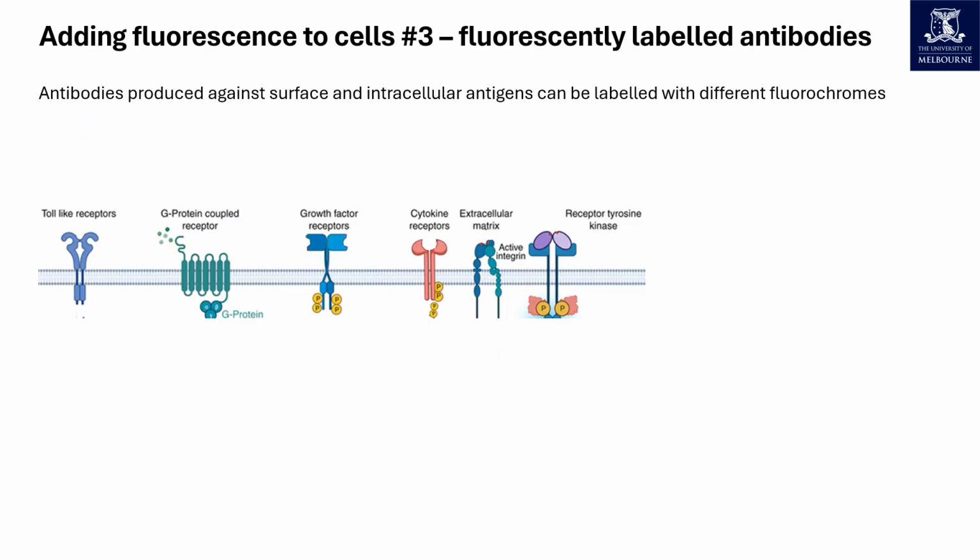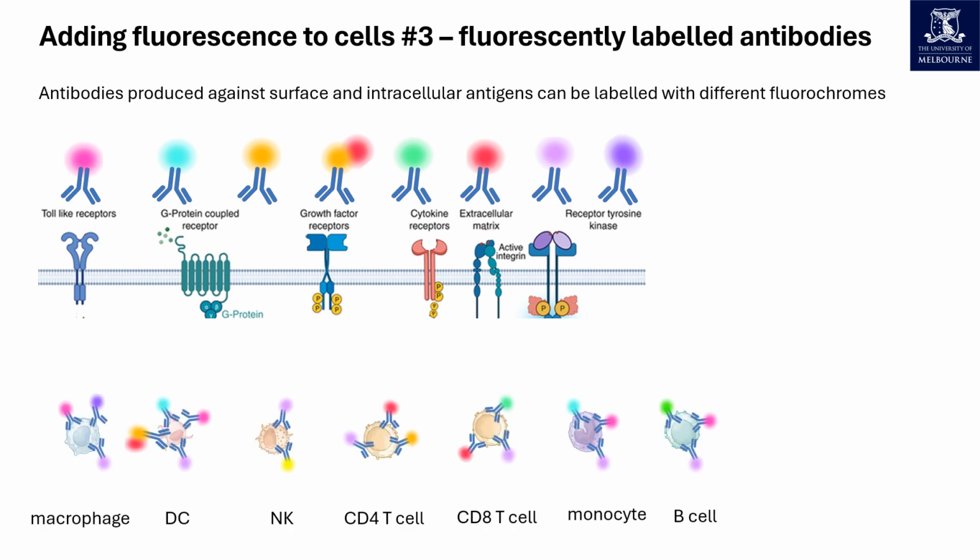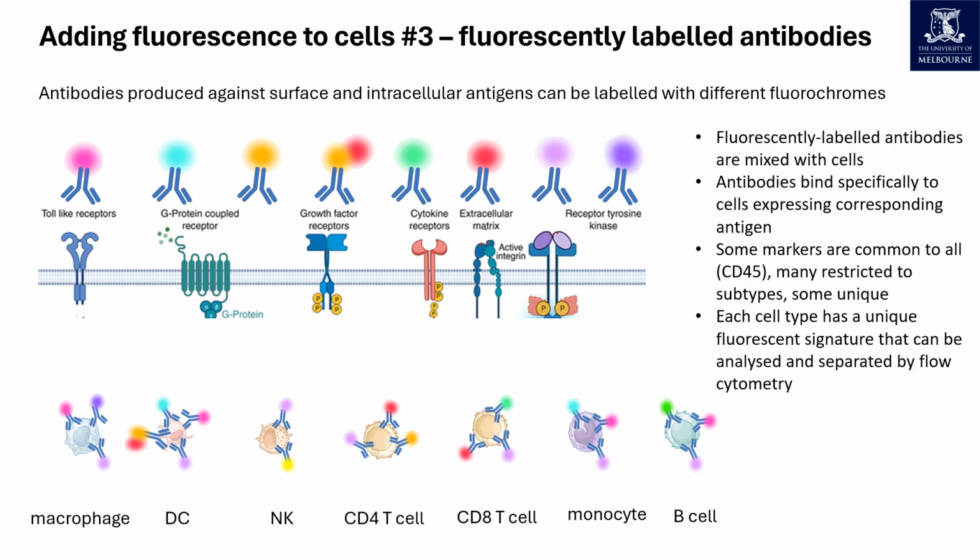In cytometry, phenotyping is achieved by the binding of fluorescently labelled antibodies specific to cell surface and intracellular markers. Antibodies bind specifically to cells that express their corresponding antigen, allowing for high-fidelity examinations of various cell types and their functions. It is often necessary for cells to be labelled with 5 or more antibodies to distinguish them from similar subtypes. Immunology and flow cytometry have grown symbiotically over the decades.